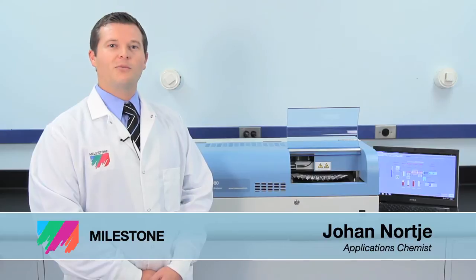Hi, I'm Johan with Milestone. Over the past few years, direct mercury analysis has seen widespread adoption due to the fact that it eliminates sample prep.